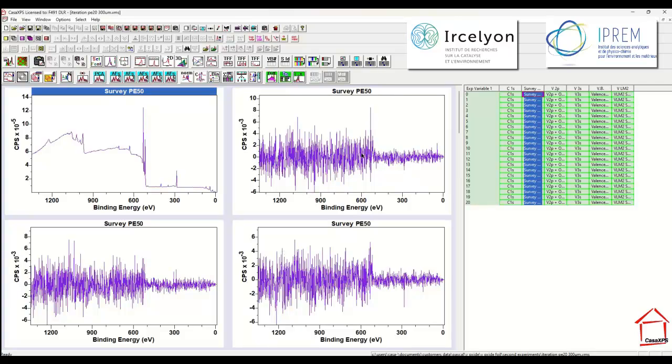These are very characteristic of Poisson noise. Pulse counted data is such that the noise is the square root of the counts per bin. So where we have a low background we see low noise, and where we have a higher background we see more noise. So this is very consistent with all of these data producing exactly the same shape.